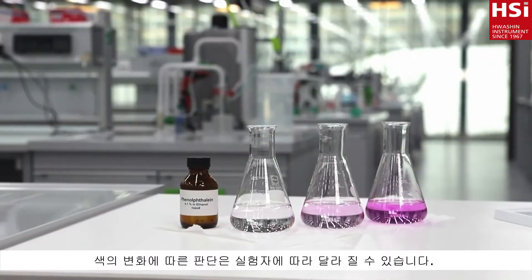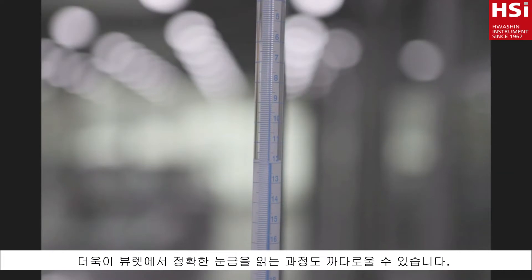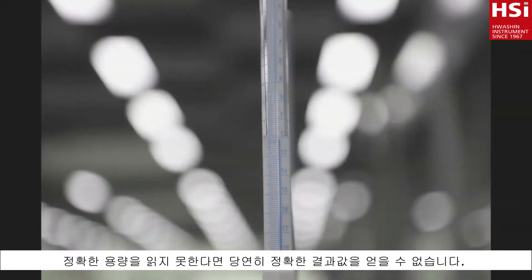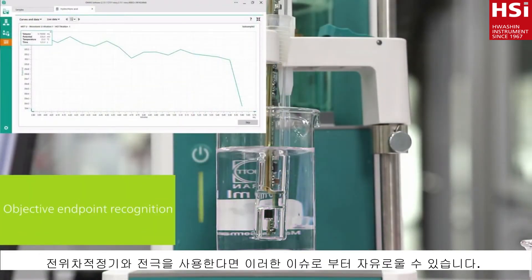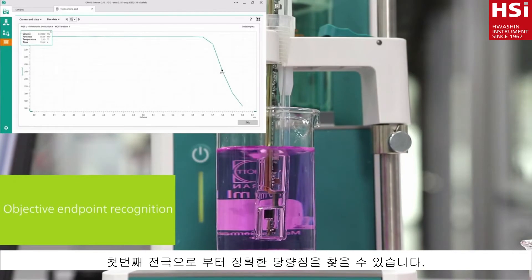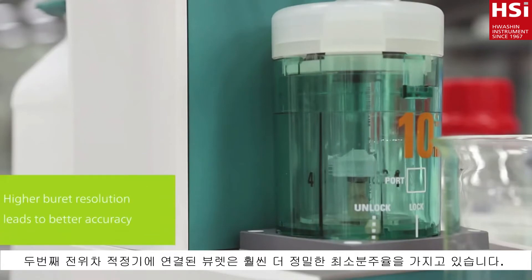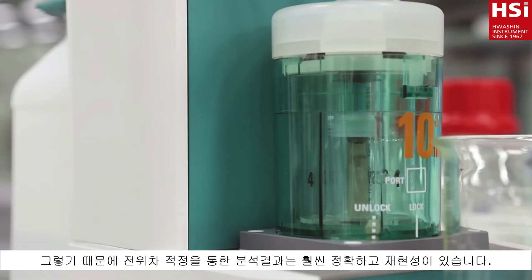Also color perception can depend on the operator. Moreover, reading the volume from the burette can also be tricky. If you do not read out the volume horizontally, you will obtain an incorrect result. Using an automatic titrator and sensor renders these issues obsolete. First, the sensor detects the endpoint objectively. And second, the burette of an automatic titrator has a much higher dosing resolution. Therefore, results calculated by the titrator are more accurate and reproducible.